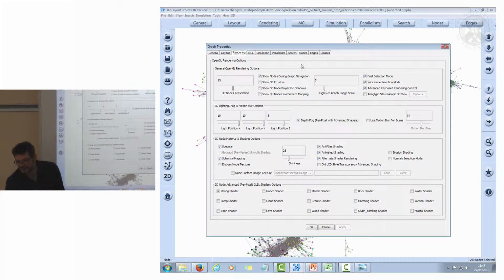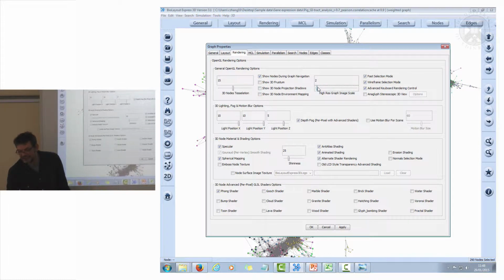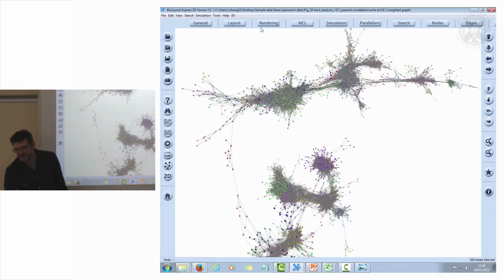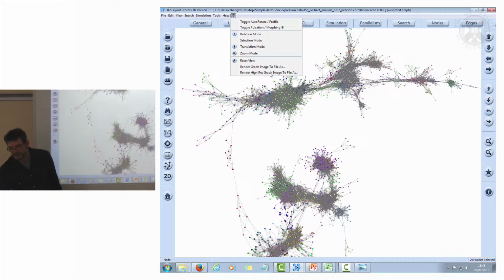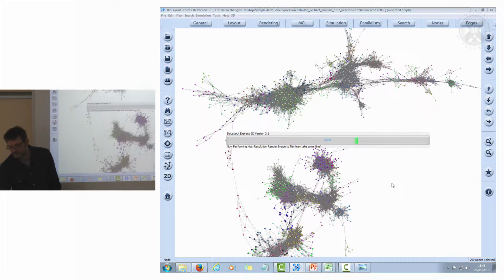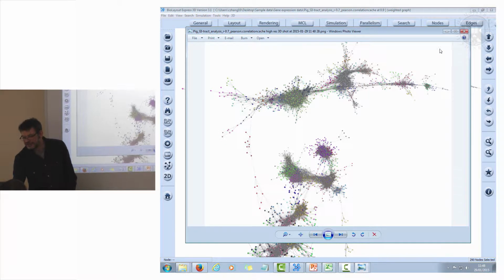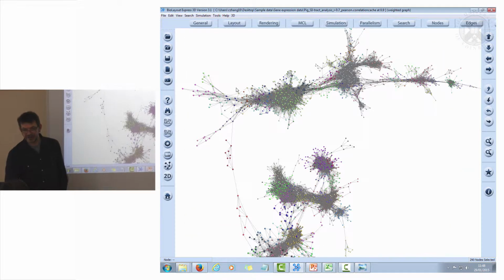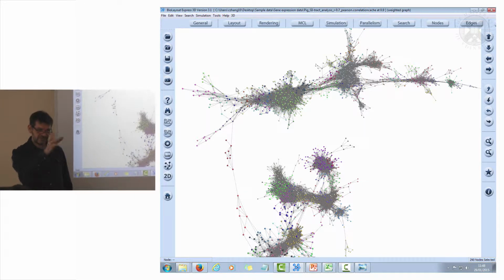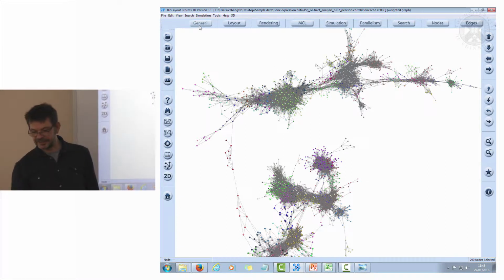And in rendering, this figure here will make it 5 times bigger. So I generally use 2, and that's big enough for all publication. That will be a lot faster now, and the file will be a lot smaller. Done. Okay, so the first thing out is a nice picture that you want to generate. Obviously, going over to 2D, sometimes you can make a nice picture, move things around, make it nice and pretty, and go on and annotate that later.